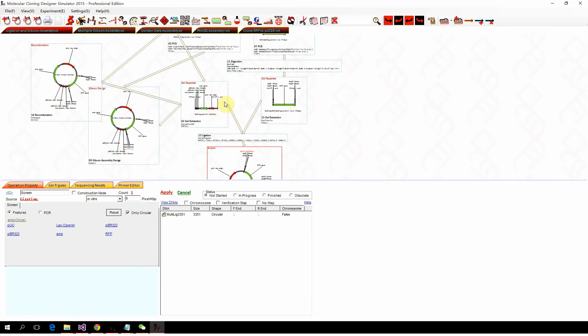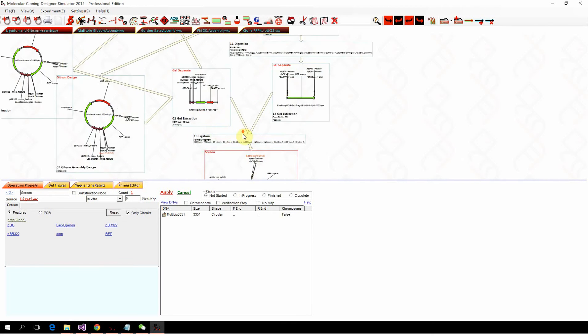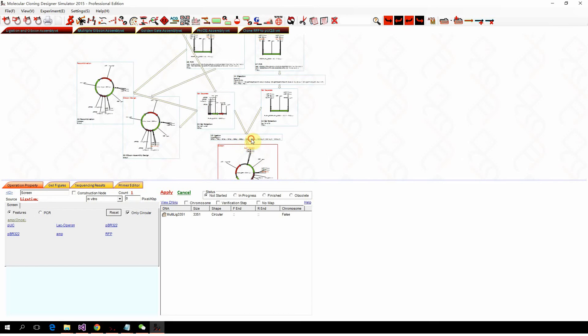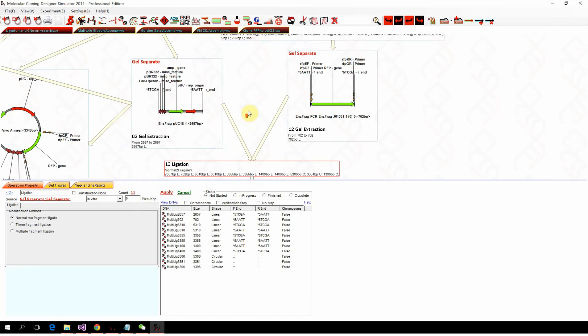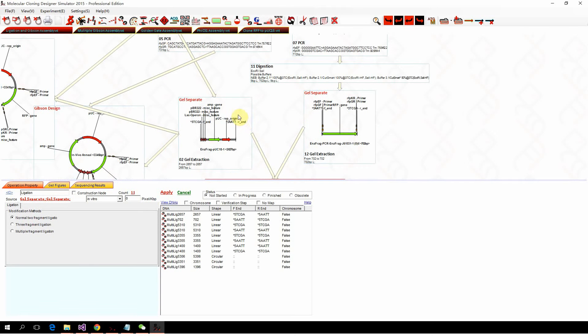All right, so that's basic Gibson assembly and ligation.